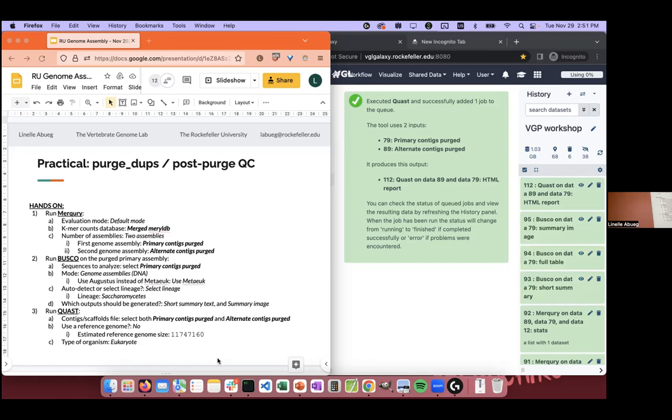I figured out that the next section is filtering. The scaffolding is going to be a lot quicker now because I'm not going to do it by hand. Okay. Yeah. That will be. You can skip the intuition. You can explain that.